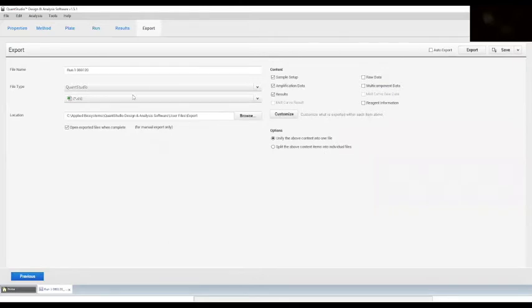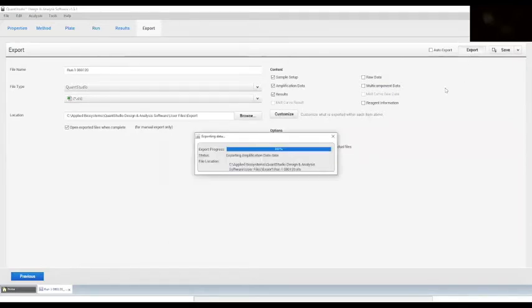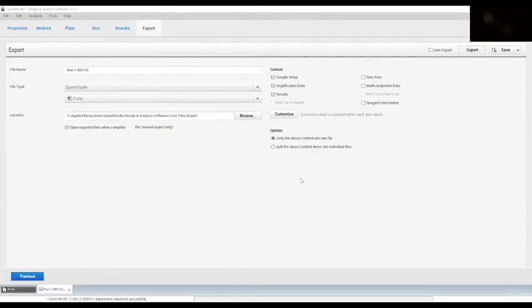Go on setup, choose sample setup amplification data and results. Lastly, choose the location where the export should go and where the files should be saved.